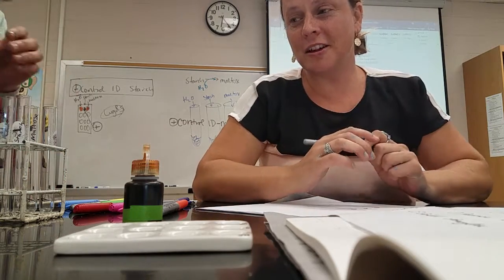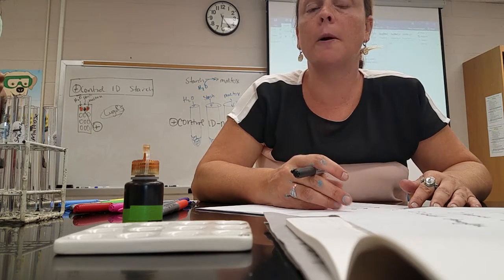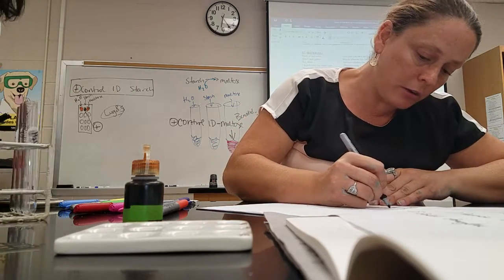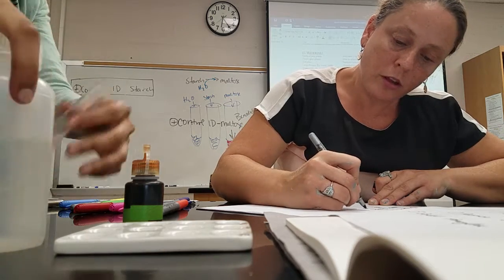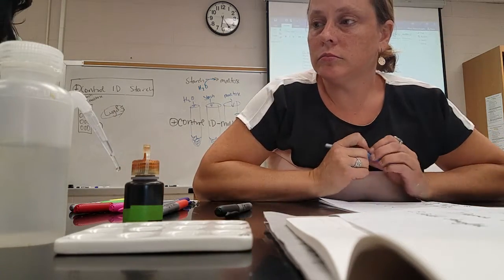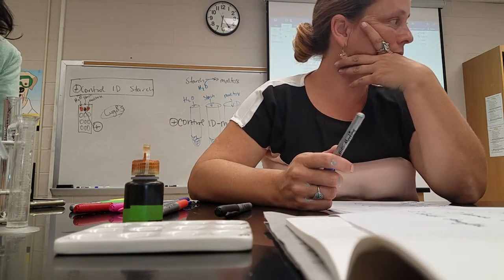Yeah, and there's a lot of confusion, because it's just a 1-to-1 thing. Basically whatever you do for Benedict's, you do the same amount for whatever you're testing. So it's the same thing: water, starch, and maltose. We're not talking about anything about amylase just yet. H2O, maltose, and starch. You can put 2 milliliters of starch in here, 2 milliliters of maltose. Try not to cross-contaminate or you'll really mess things up here.